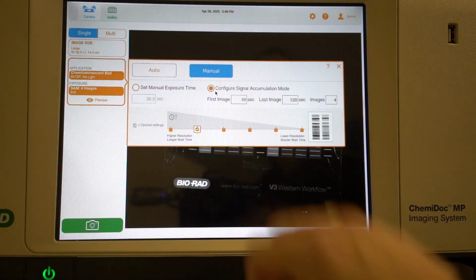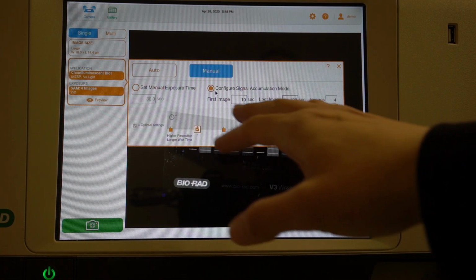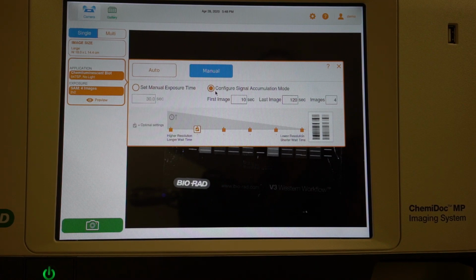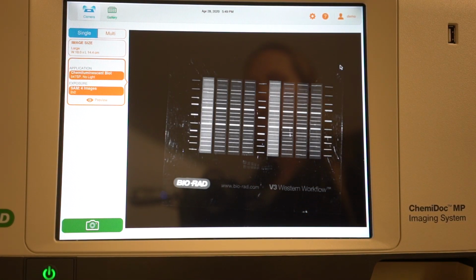You also have the option for signal accumulation mode, which allows you to take a certain amount of images in a certain amount of time. And as that time goes on, the imager will take more and more pictures. The exposure gets longer and longer. And then when you go into your gallery, you can see each one of those consecutive images. You also have the ability to look at the binning and change those settings as well.